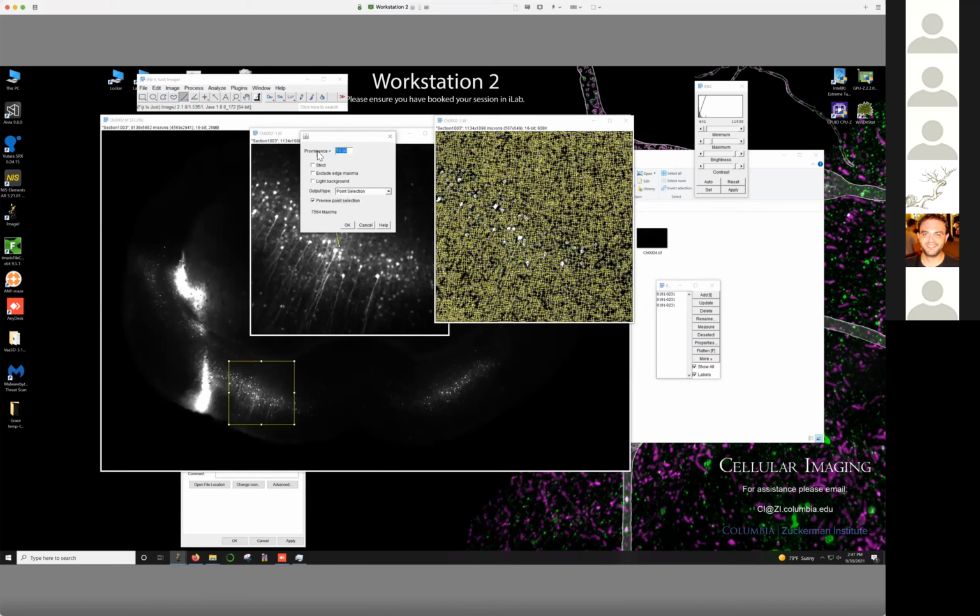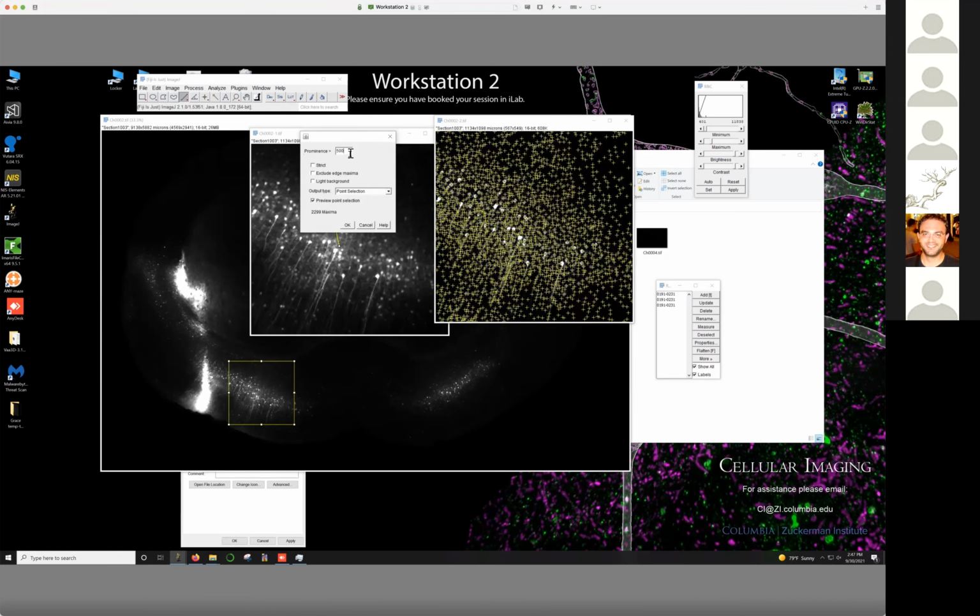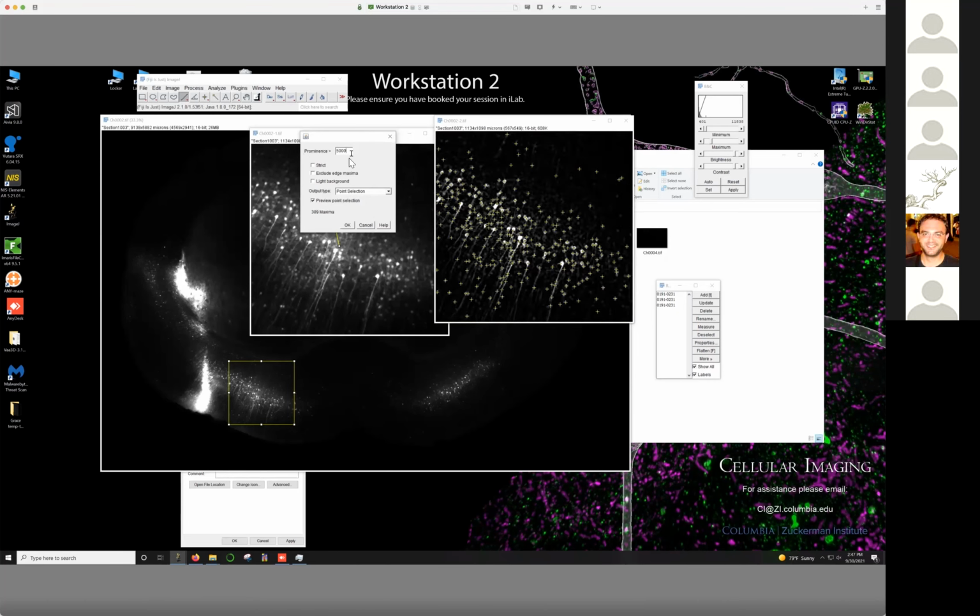We obviously need to set some kind of threshold. You see it's not doing a great job here. It's picking up cells along the projections, but you can get the idea of how a maxima detection would work. It's finding these local regions of bright signal. This actually works well when the samples are very easy, but for most of you, you won't have easy samples, and so this is when I would recommend using something like Ilastik.